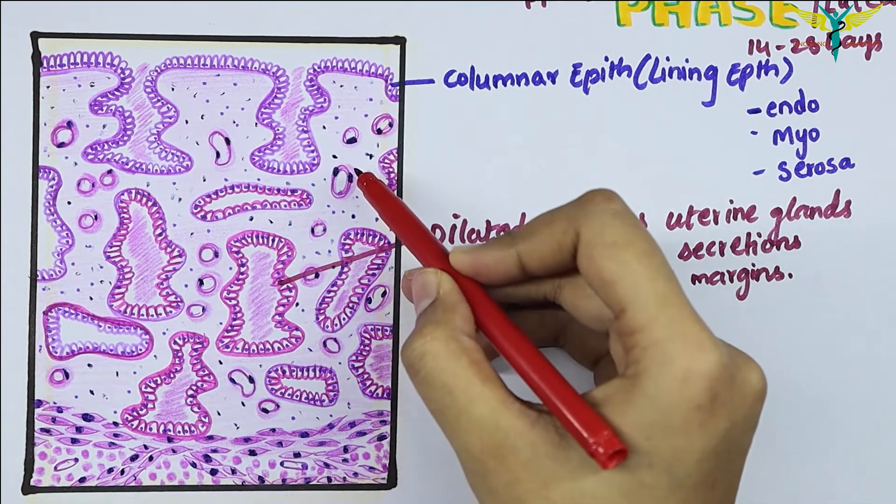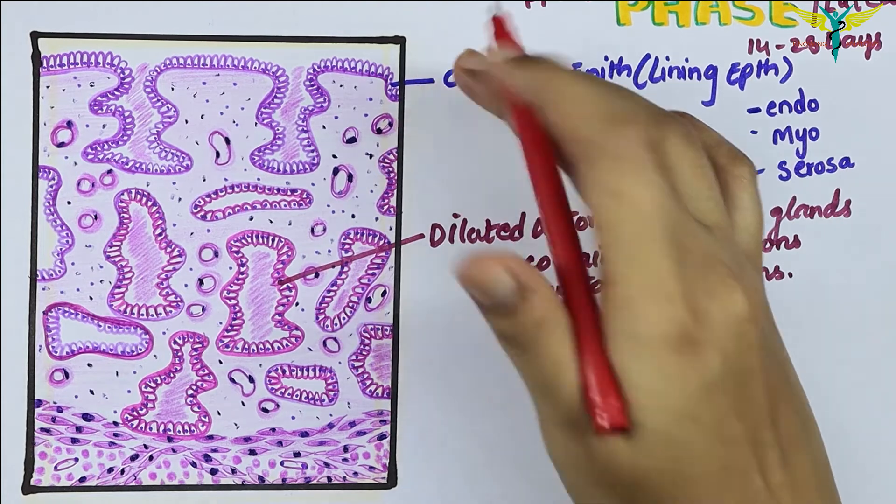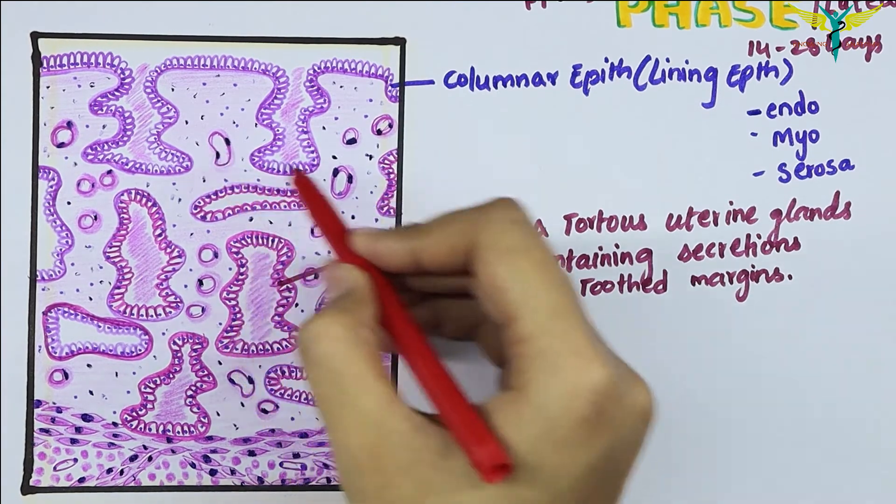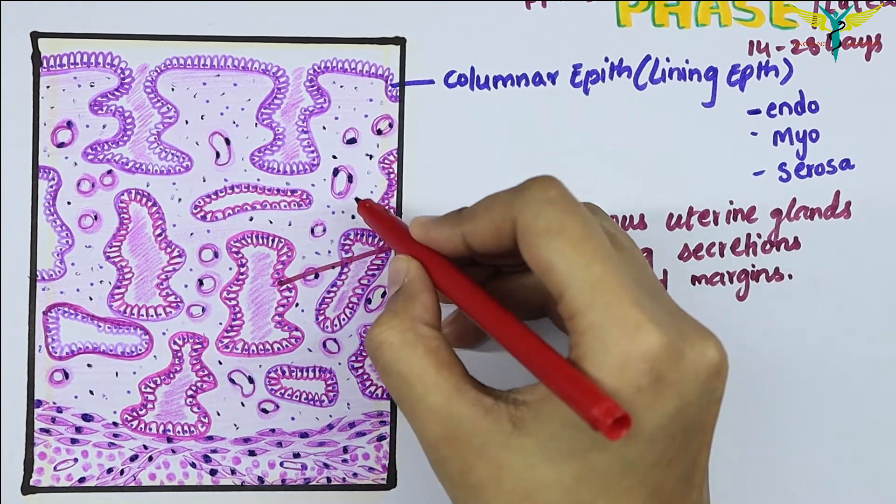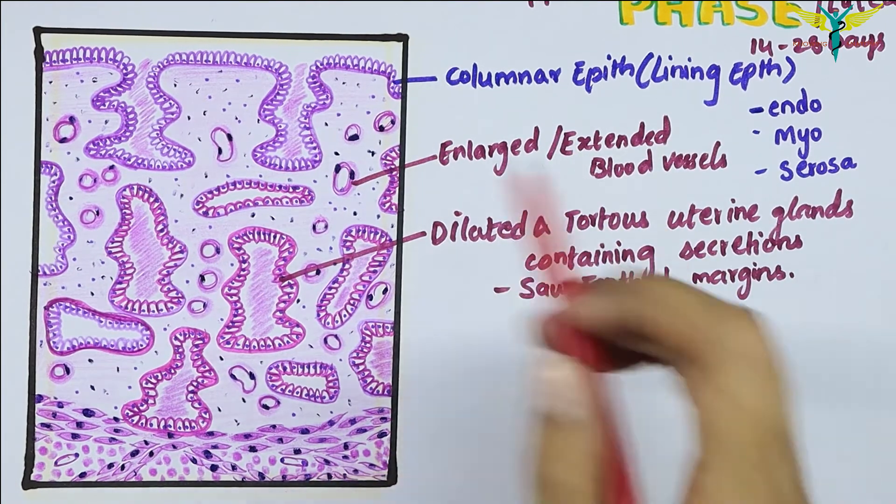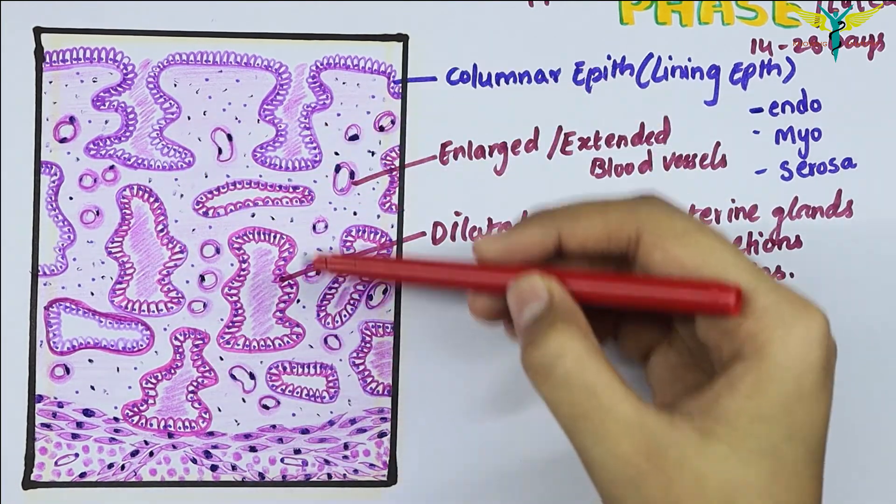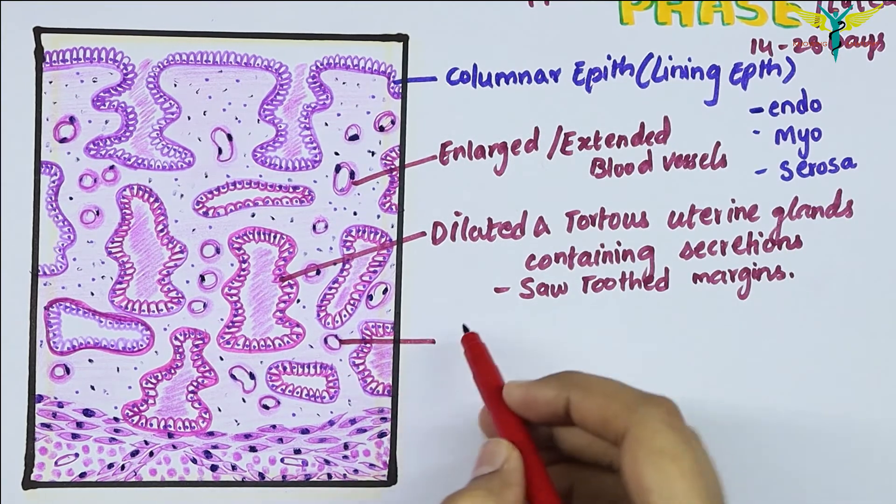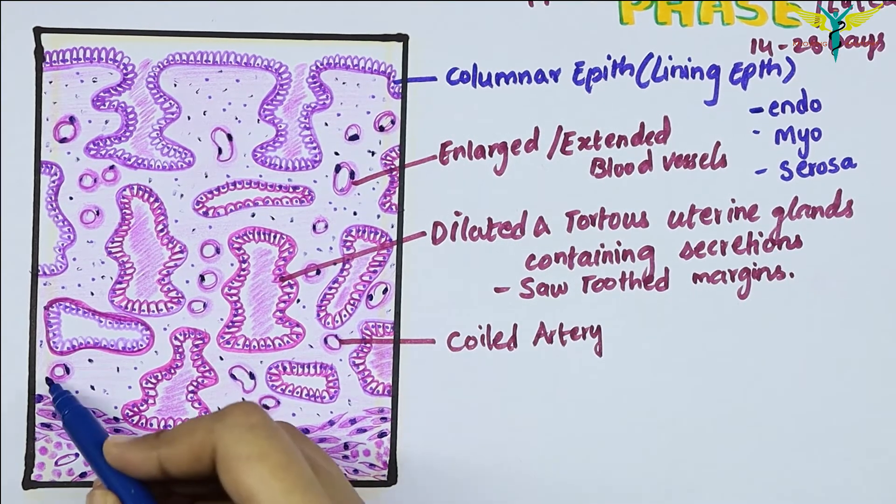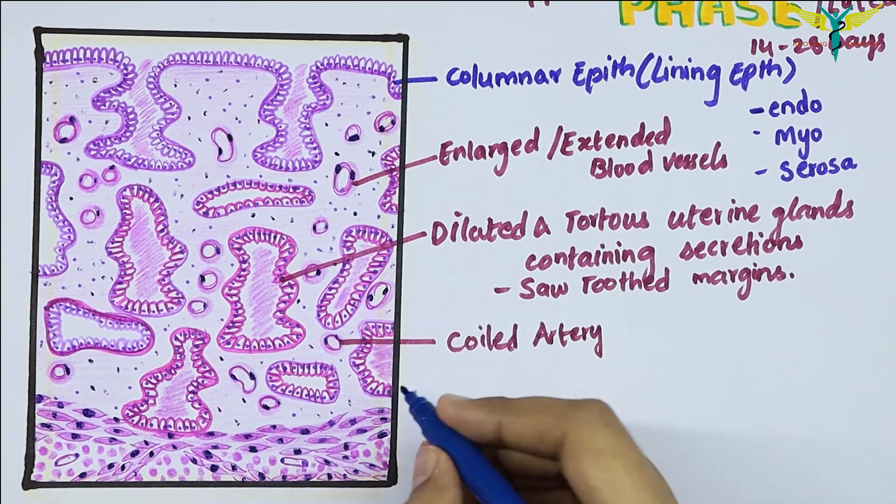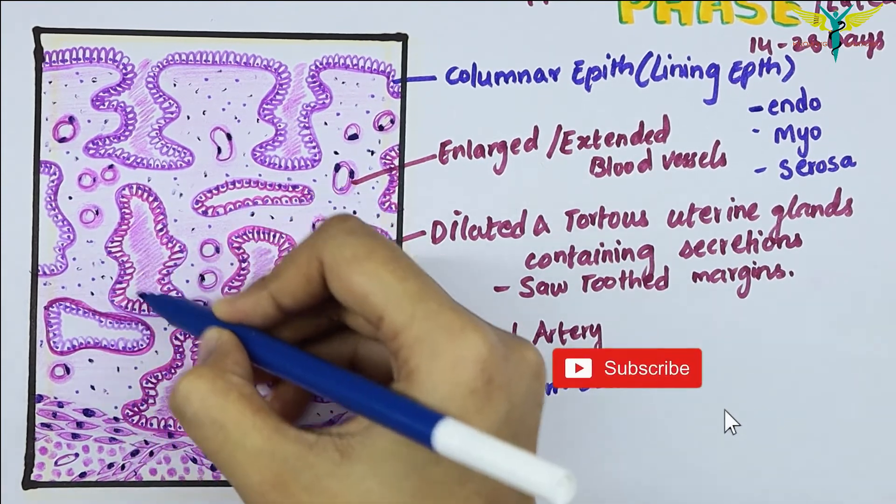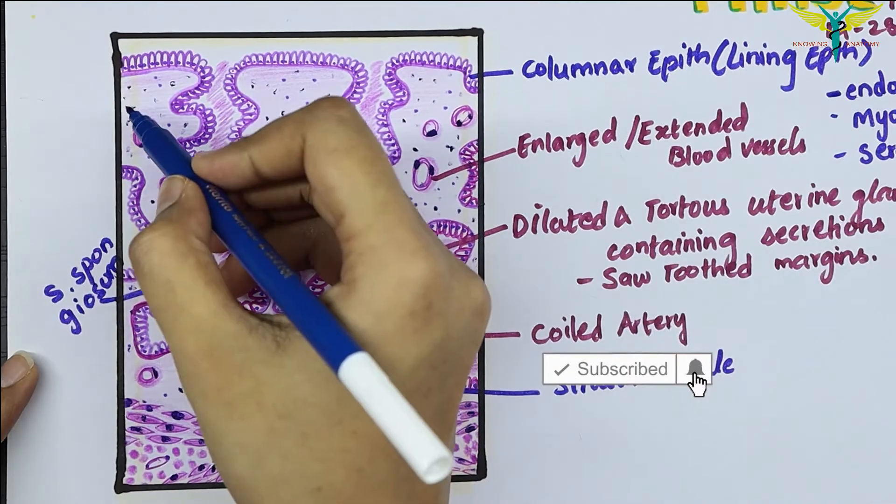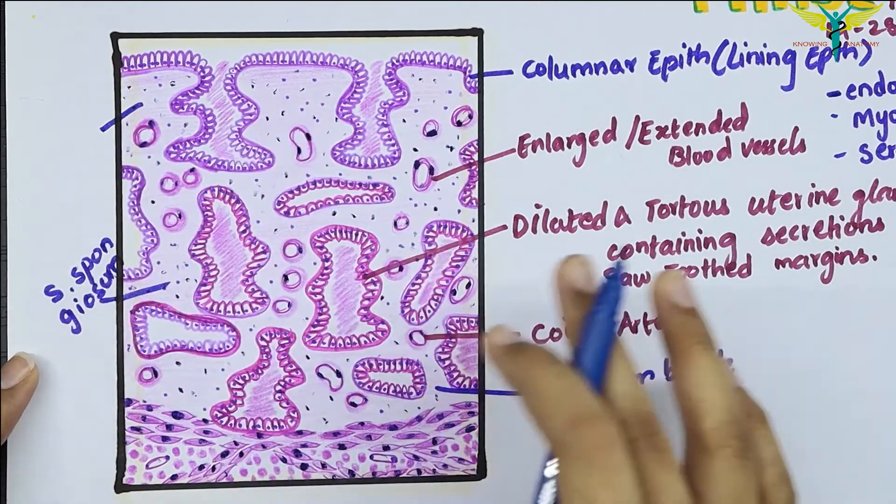You can see the expansion of the blood vessels in the upper portion of the endometrium. These are the enlarged blood vessels. Note the presence of many blood vessels which extend up to the top layer of the endometrium, and these are the coiled arteries. This is the basal part, called the stratum basale. This part is the stratum spongiosum, and this part is the stratum compactum.